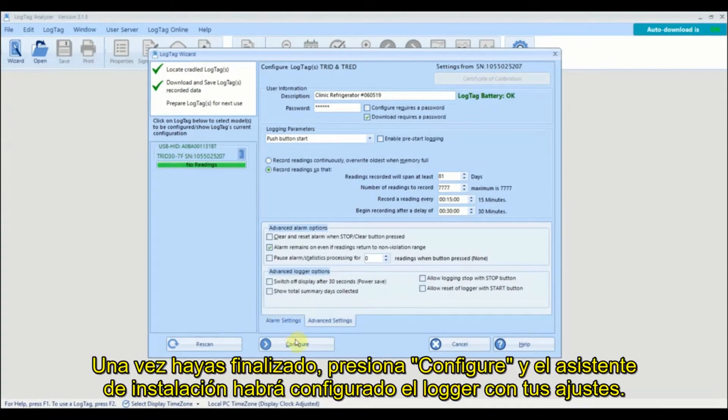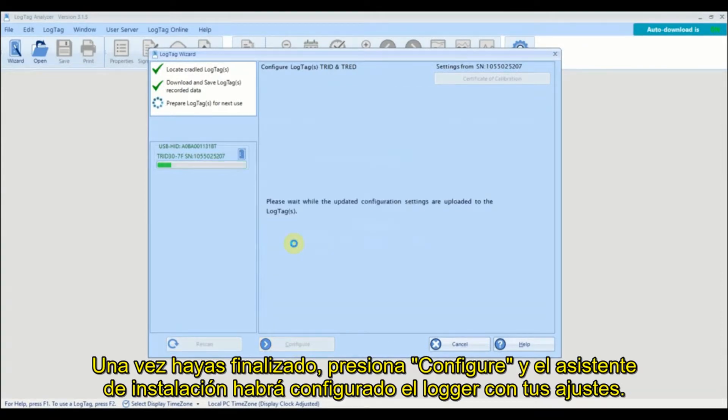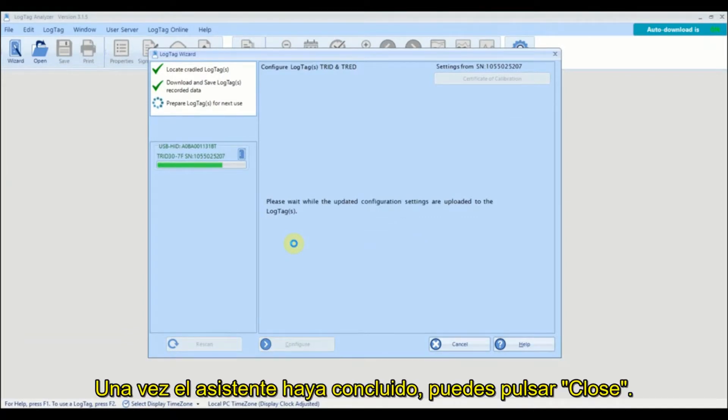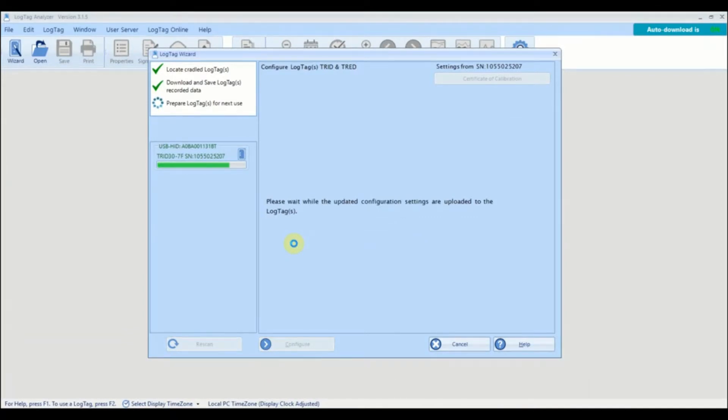Once you are ready, click Configure and the wizard will configure your logger with the settings you entered. Once the wizard has finished, you can click Close.